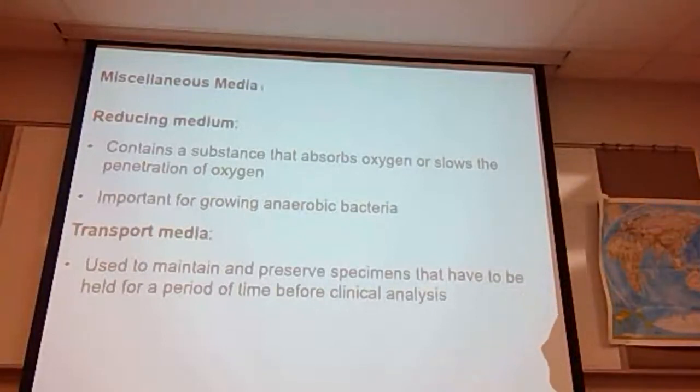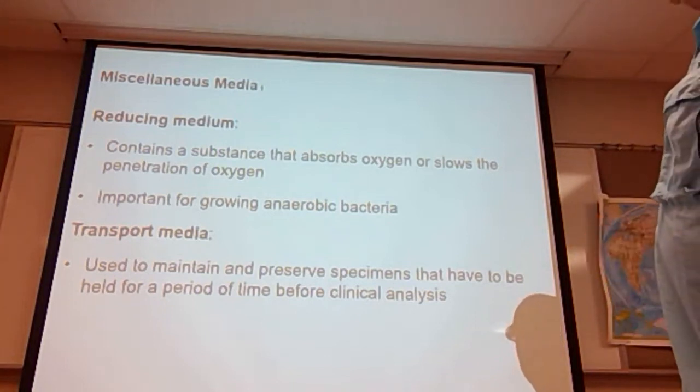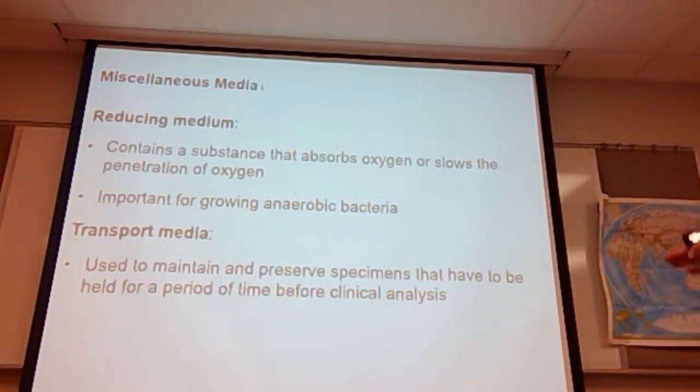Finally, some miscellaneous media. We have a reducing media. We don't use reducing medias in our lab, and we don't use transport medias, but it is important that you know what these things are. Reducing media is one that contains a substance that absorbs oxygen or slows the penetration of oxygen. These are important in growing anaerobic bacteria.